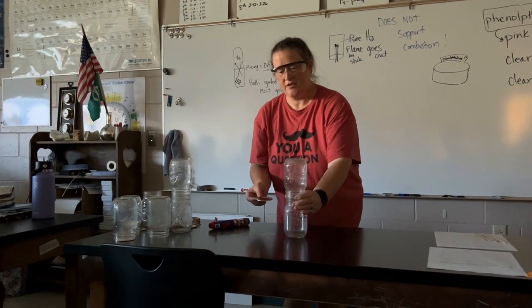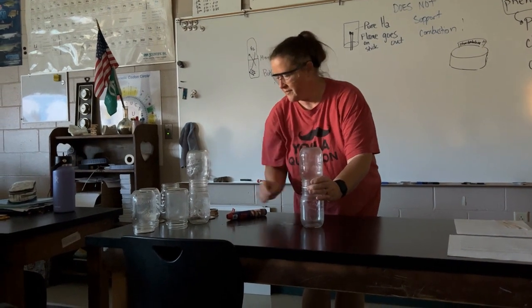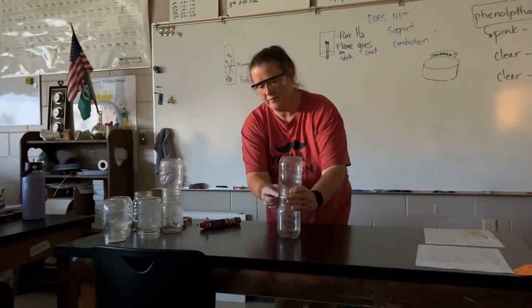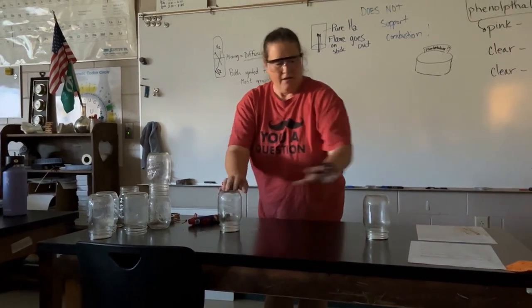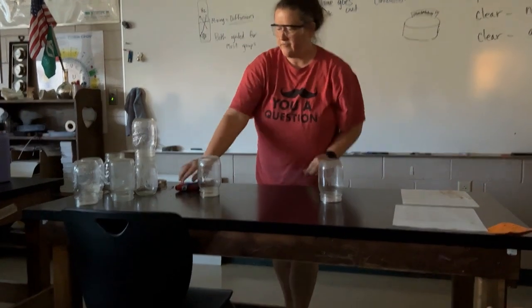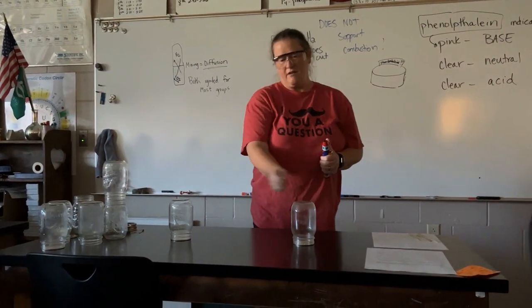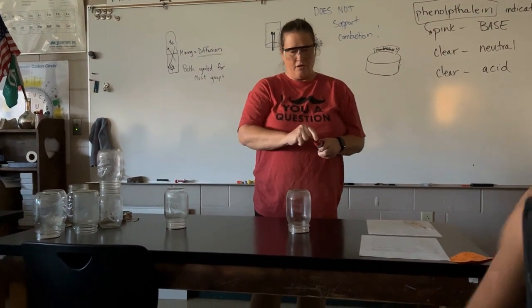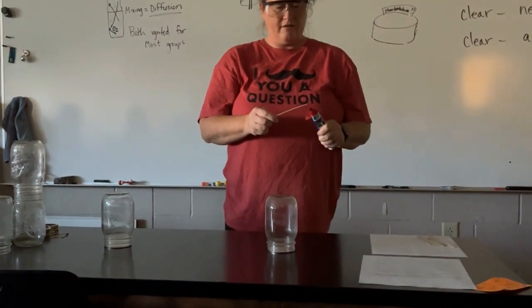All right, this is take 2, demonstrating diffusion of a gas. The first one didn't work. I'm going to separate the hydrogen gas jar, which was on top, from the oxygen gas jar from the bottom. Theoretically, there should have been some diffusion taking place, and we should have probably equal amounts of hydrogen and oxygen in each of those jars. If both jars ignite, it will show evidence of that diffusion.